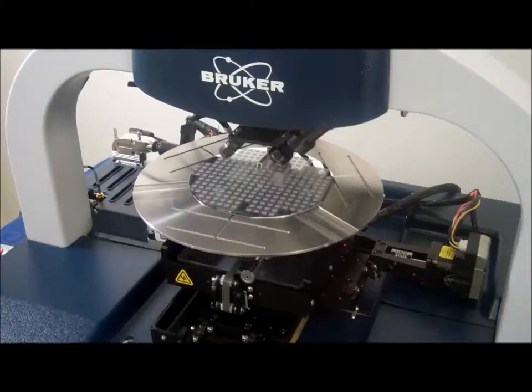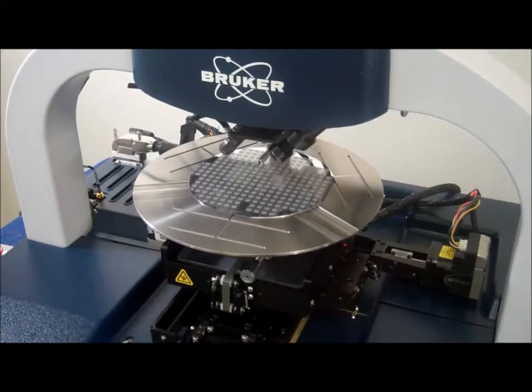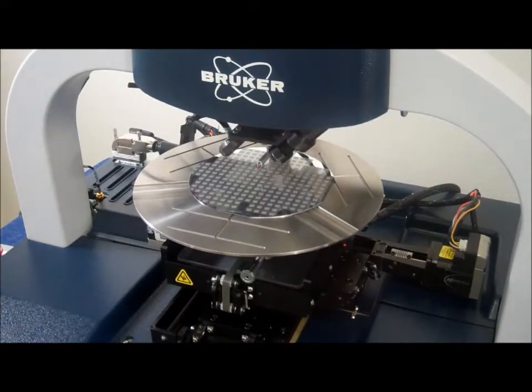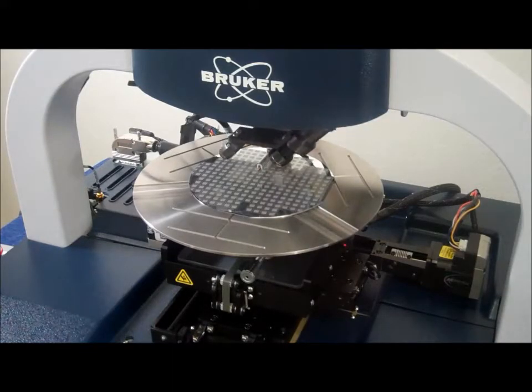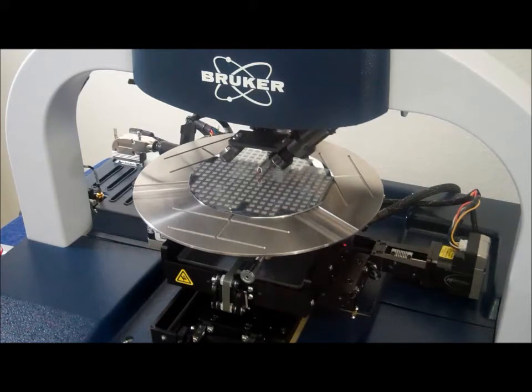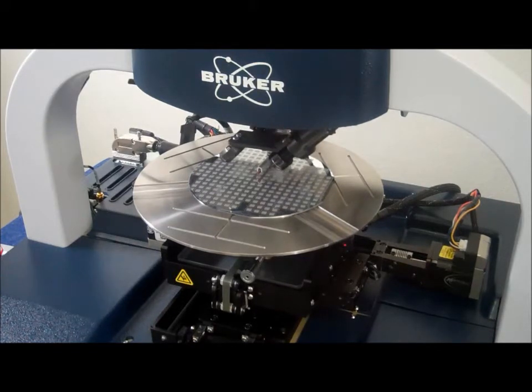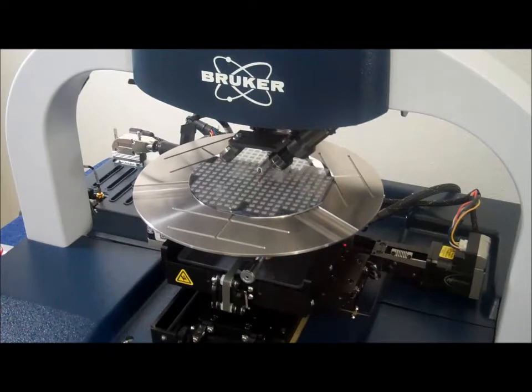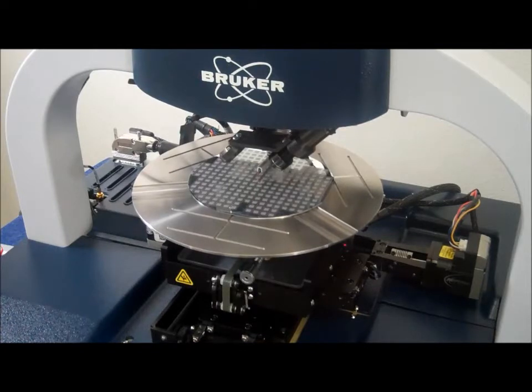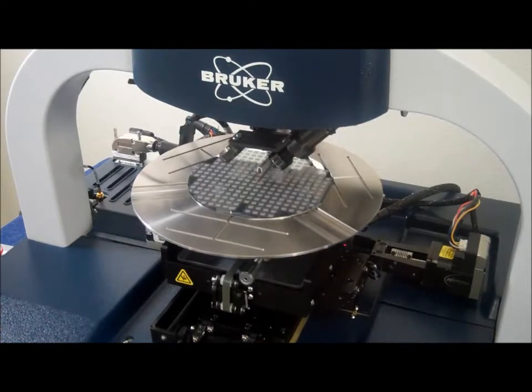The DECTAC XT system takes sample profile measurements electromechanically by moving a diamond tip stylus over the sample surface. The scan is completed following a user programmed scan length, speed, and stylus force.